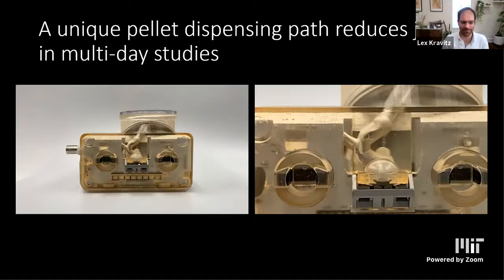And this took a lot of iterations. This is what we came to. You can see it in the clear print: a mechanism that slows the pellet down and gets it to land directly in there. I find these videos pretty cool.